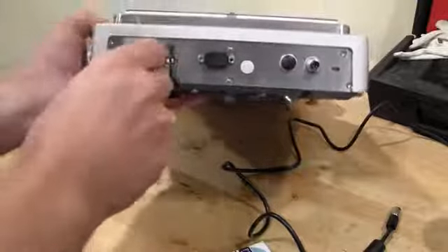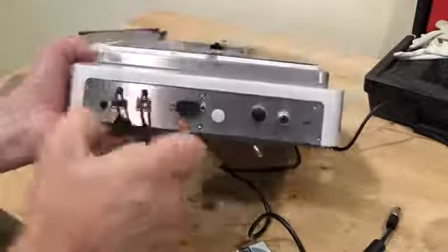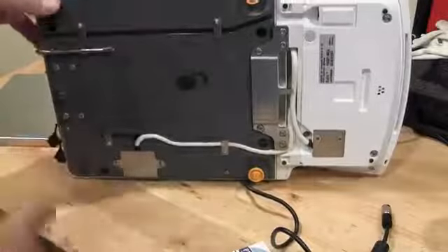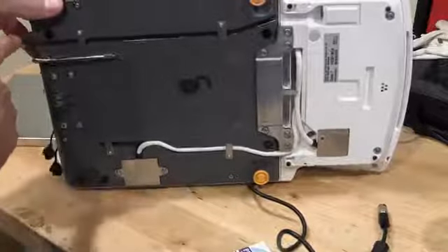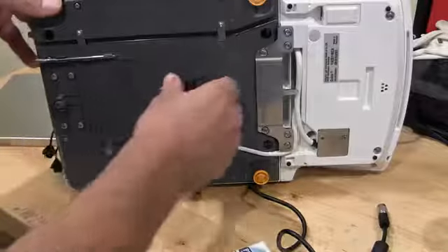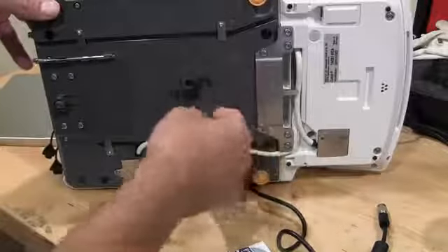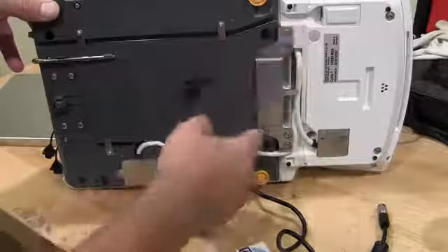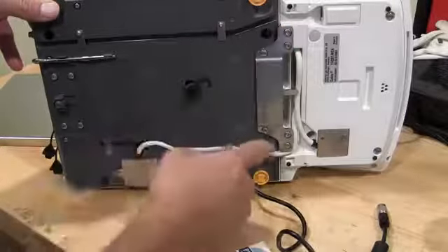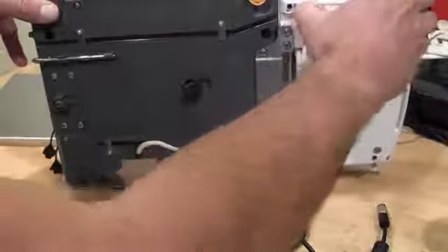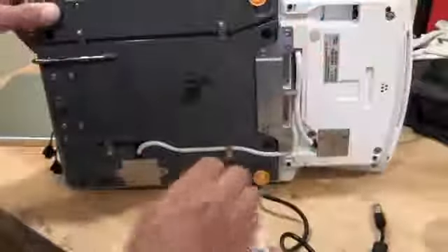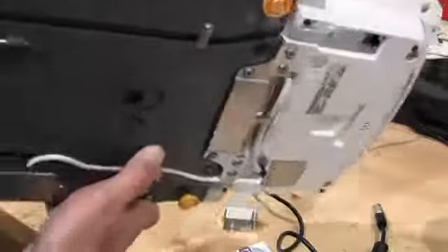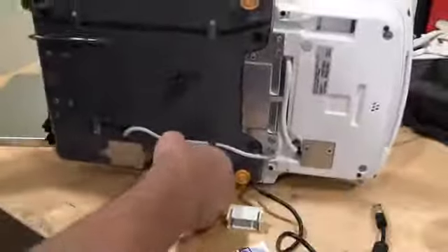Another USB port here. Bottom of the balance, you have an underhook. Over here, here's your underhook port. This display can be removed if you'd like. You have to undo the screws and then you can see the cable in here. This balance also has ethernet connection. Not too sure if you can see that, there's ethernet. And this particular model has the motorized internal calibration.